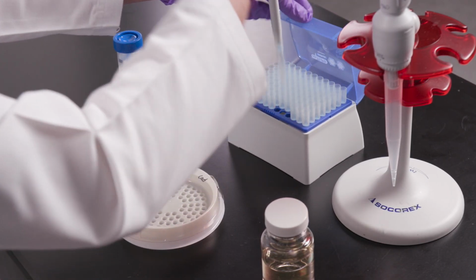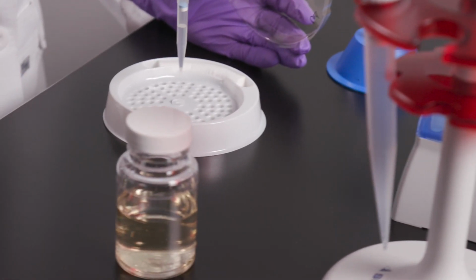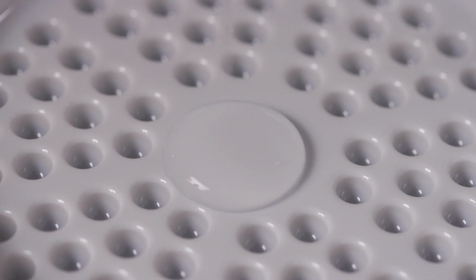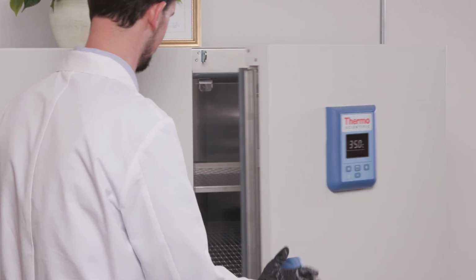This process is strictly manual and requires 1 milliliter of sample water to 9 milliliters of media, which is the food bacteria eat. The sample is inoculated by mixing with the enzyme substrate media, and plates are then incubated at 35 degrees Celsius for 48 hours.